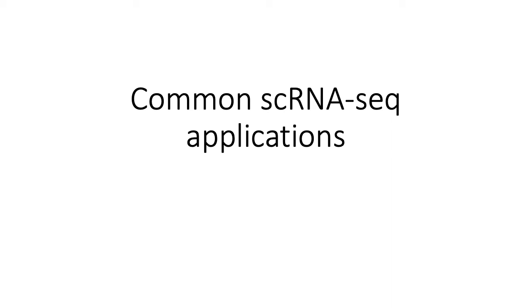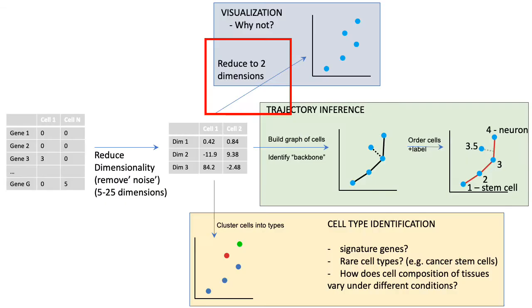So now we'll finish by circling back to the broad goals and applications of single-cell RNA-seq technologies, and basically just do a little bit more visualization on what those goals are. Right, and so one of the next major applications of single-cell RNA sequencing is obviously visualization of your data, which essentially amounts to plotting your samples or your cells that you've sequenced in a 2D scatter plot.